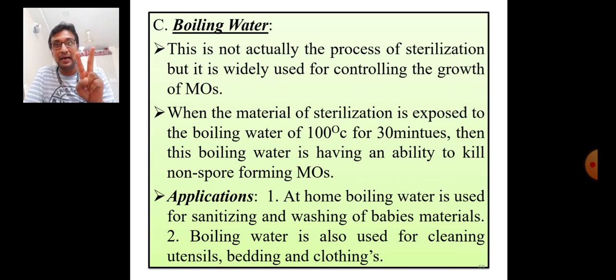आज 2 मेथड झाल्या आपल्या मॉइस्ट स्टरलायझेशनच्या. पहिली होती ऑटोक्लेविंग आणि दुसरी होती टिंडलायझेशन. टिंडलायझेशनलाच दुसरं नाव आहे इंटरमिटंट स्टरलायझेशन. ऑटोक्लेविंगसाठी वापरला जाणारा जो ॲपॅरेटस आहे that is called as autoclave. टिंडलायझेशनसाठी वापरला जाणारा जो ॲपॅरेटस आहे that is called as the steam Arnold.